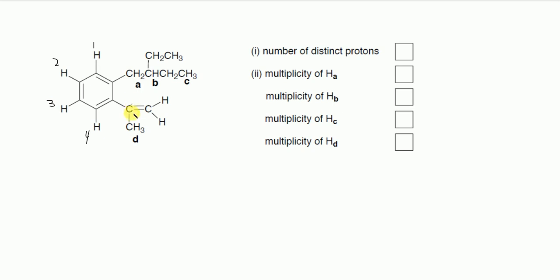This carbon has no hydrogens. Okay, this carbon does have hydrogens. CH3, 5. Okay, so each one of these hydrogens, these are all the same. Even though there's 3 over here, they're all the same. So this is just 5. Okay, and now I have these hydrogens that are over here, 6, 7. They have their own stereochemistry. One is, relative to the other, they're very different. Okay, so each one of these is chemically unique, even though it's on the same carbon. We're not used to that, but they are unique. So this is 5, 6, 7.